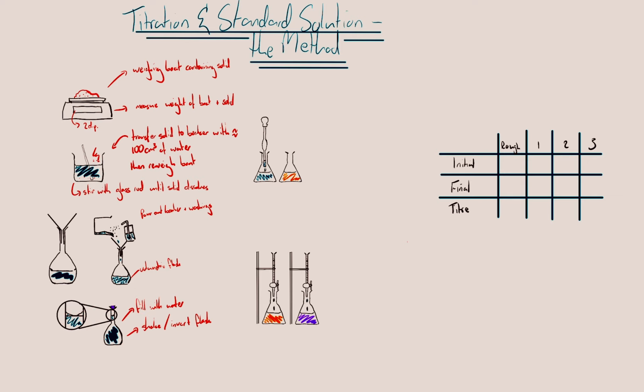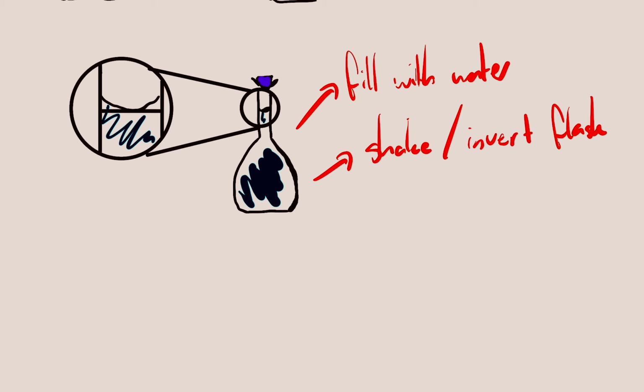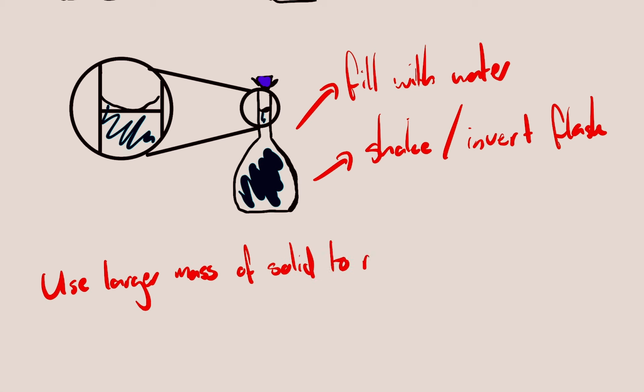One other thing we can do is we can use larger mass of solids to reduce any uncertainty.